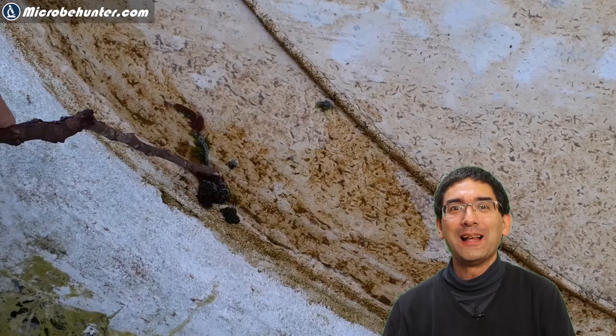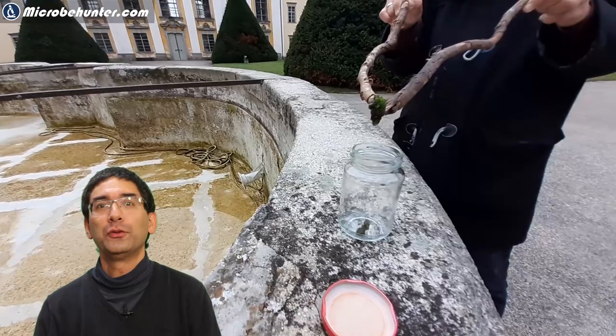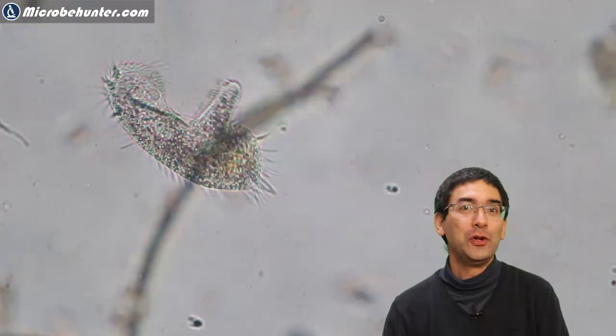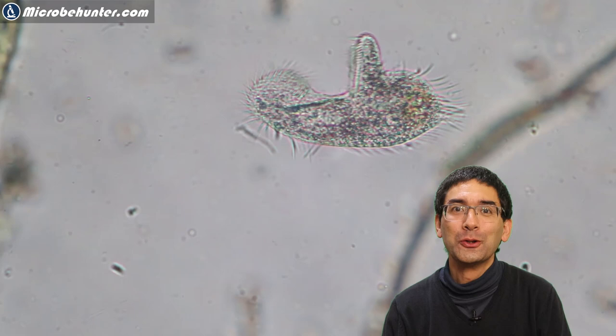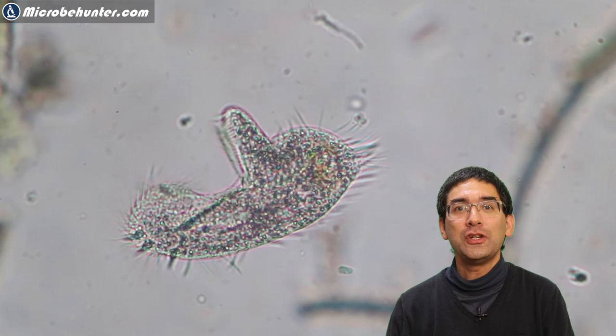Well, I was pretty lucky with that one because this was really teeming with life, and I found all sorts of different microorganisms and of course also this rather unusual looking ciliate. And if you can help me out and if you're able to identify what this ciliate is, then please do write a comment here.